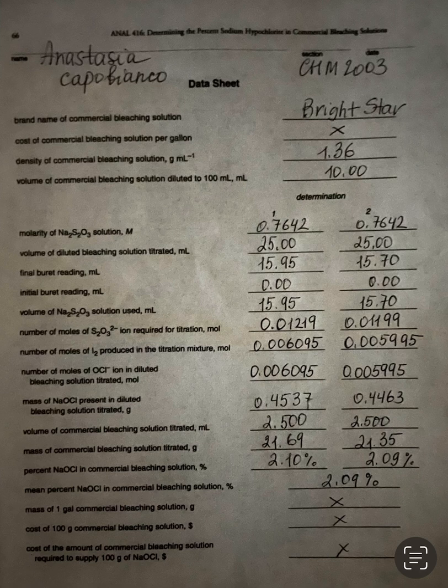Okay, next step. Volume of commercial bleaching solution diluted to 100 milliliters, in milliliters. As you remember, as we were doing our experiment, we took only 10 milliliters of our bleaching solution from the container that was bought in the store, right? Only 10 milliliters, and we put it in a volumetric flask of 100 milliliters, and we added 90 milliliters of water to the marking.